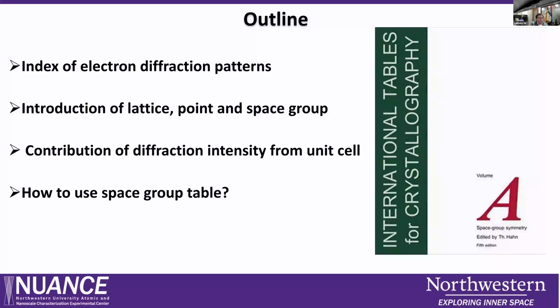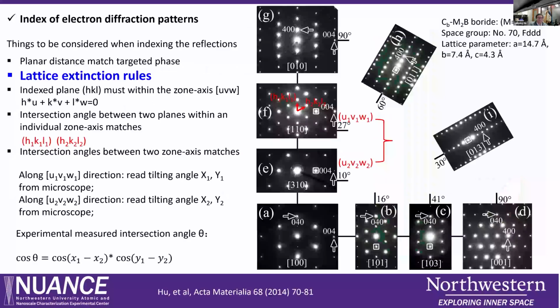I basically refer to this book. If you want to read more details, you can check it. It's the International Tables for Crystallography. There are other volumes, B, C, D, but I use volume A.